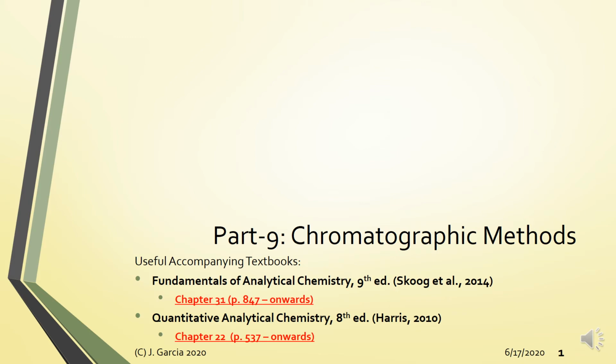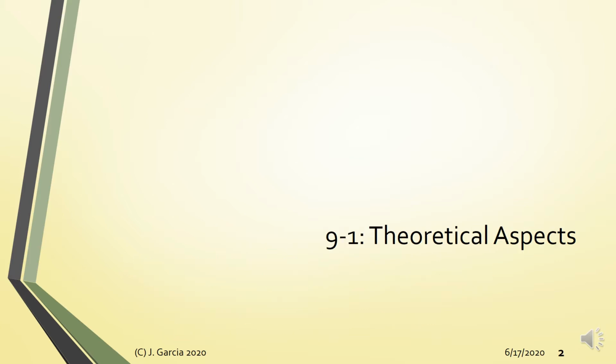So we are now in part 9 of our discussions on instrumental methods of analysis. For this portion of our lecture, we will be discussing the chromatographic methods, particularly gas chromatography and high-performance liquid chromatography. So first, let us discuss some of the theoretical aspects of chromatography.